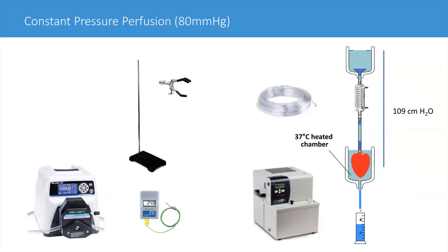This can be achieved by pumping the buffer to the reservoir using the same rate of perfusion flow for each heart, using the pump. The distance of the heart from the top of the reservoir can be adjusted accordingly to the intended pressure needed in the particular experimental setting.